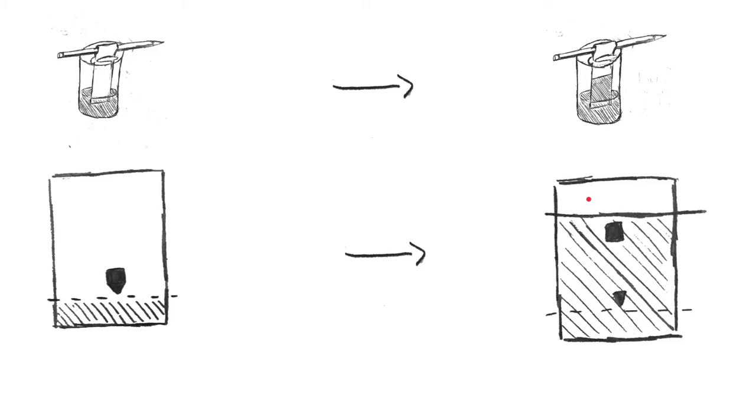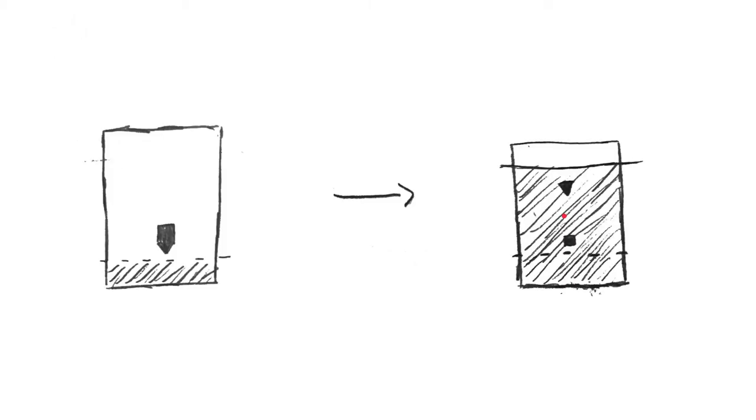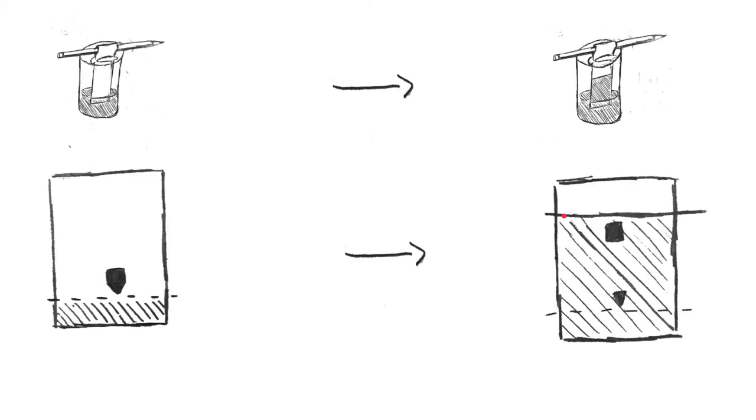What do you notice? You should notice that our substance has separated into a square and a triangle, and that the square has traveled up further than the triangle. Try to think about what this might tell us about the polar properties of the square and triangle. This information would show us that the square is more nonpolar than the triangle.